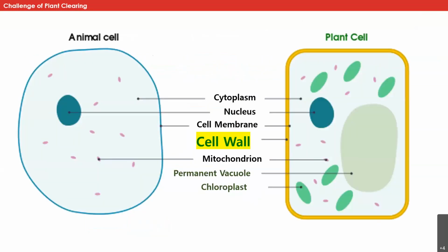As I mentioned a little bit earlier, plant tissues are actually a little bit more simple to clear than mammalian tissues. But there is one difference within plants versus animal cells that does hinder the labeling, which we'll address more at the end. And that is simply the cell wall. While plants may clear out very well, it's the labeling and getting your antibodies, if that's what you will be doing, into the cell.